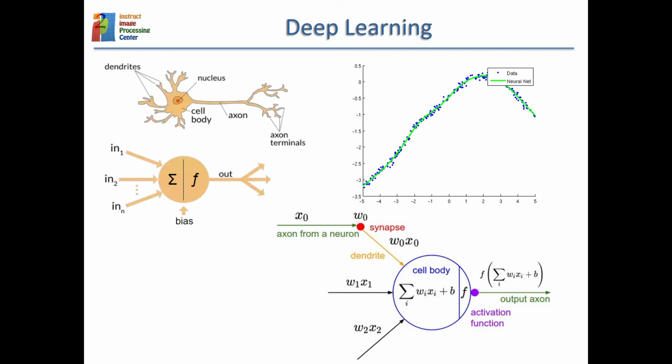And before finishing, I would like to introduce some operations that are also done on images that are very common now. You may have heard about these deep learning algorithms. Deep learning algorithms come from a computational domain called machine learning and neural networks.